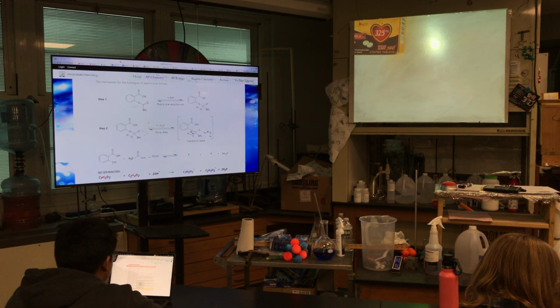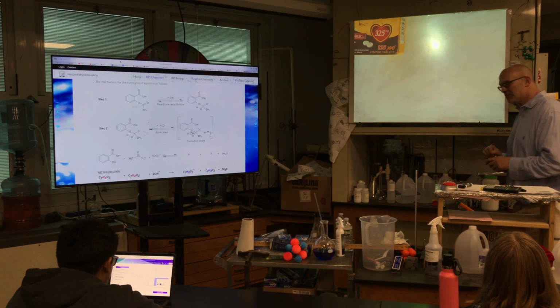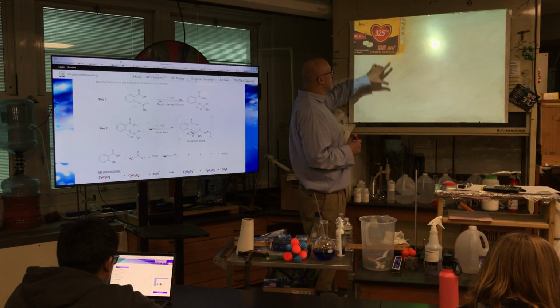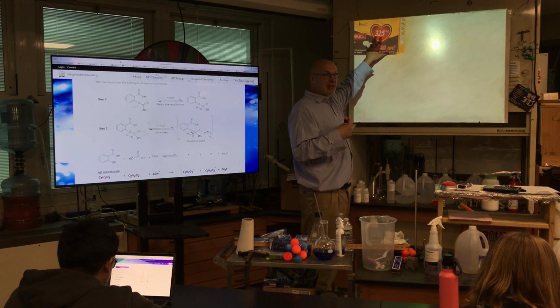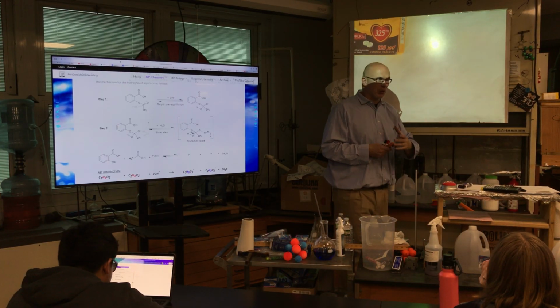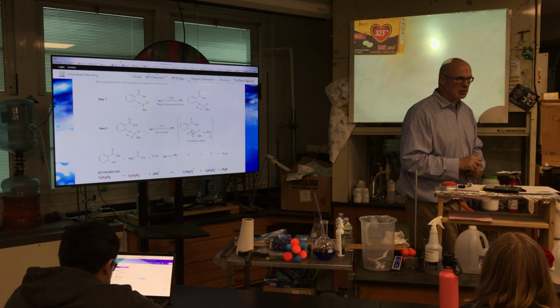All right, so we're designing our aspirin lab from scratch, and we're using the Target 325. We did this already once, but I want to revisit it because we're going to go a little farther today, and a few people got lost in the sauce here.